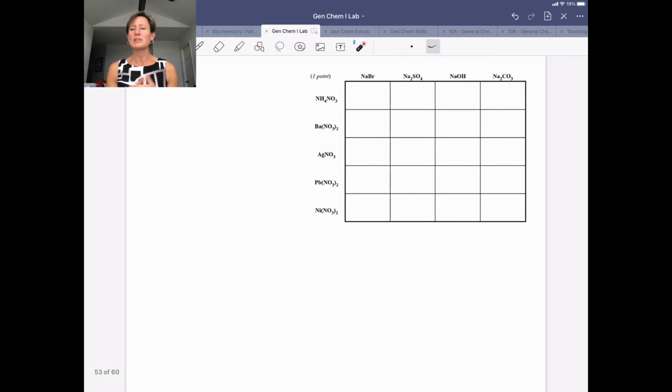All right, so let's get into a little bit of the logistics. Dr. Brown has a great experimental video where you can actually see what this setup looks like. I've tried to recreate it here just in a virtual space. But the main thing, and I'll highlight this several times here, is your data is only going to be as good as the solutions that we have.